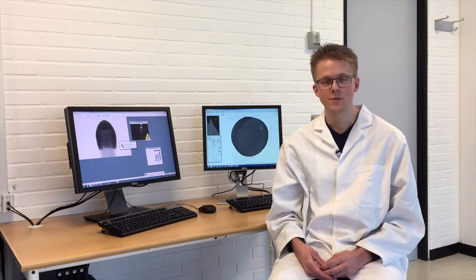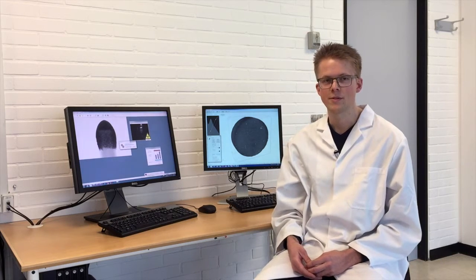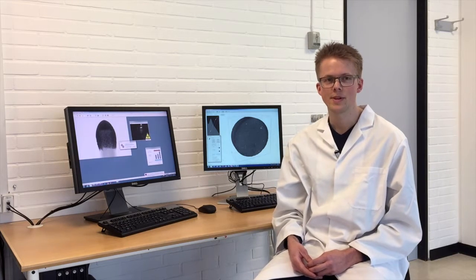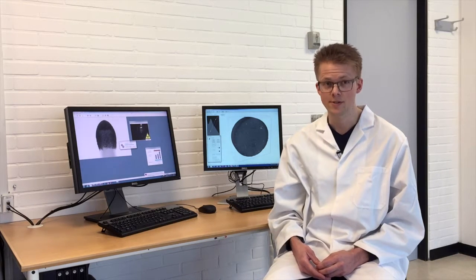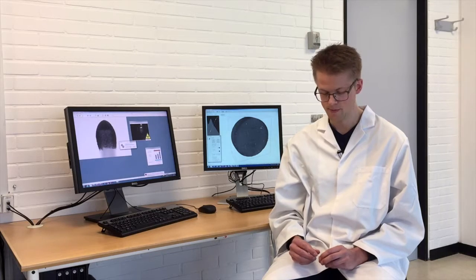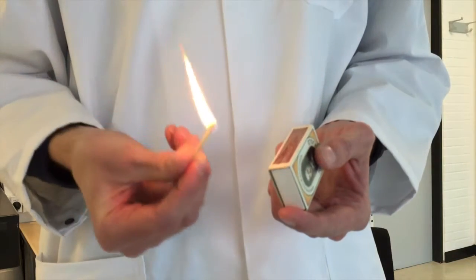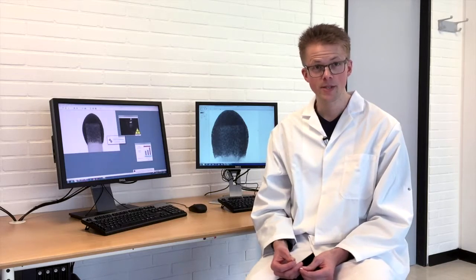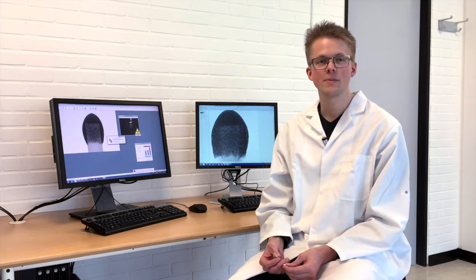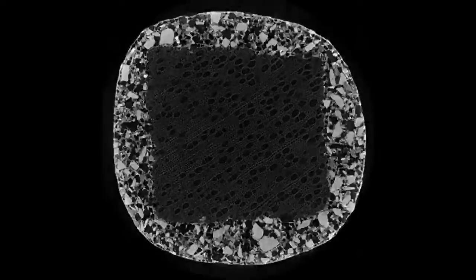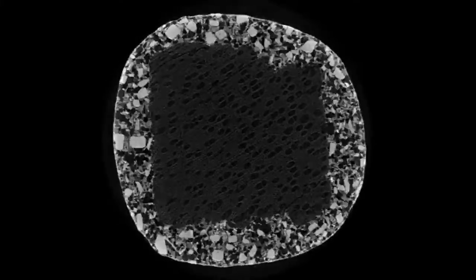CT scanning is the newest addition to our laboratory. With it we can study the internal structure of materials — for example, this match here. The CT scanner projects a beam of X-rays through the sample while the sample rotates around its own axis, and from the projected images we can reconstruct what the internal structure of the sample looks like.